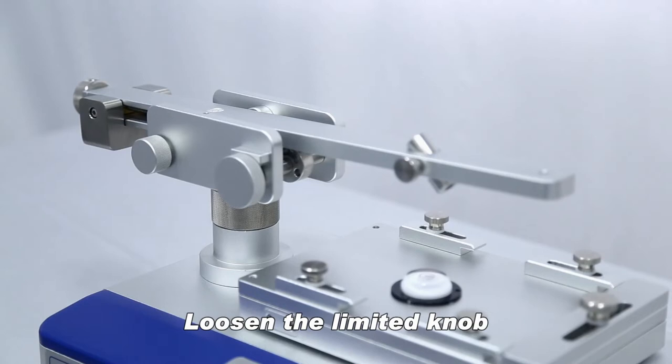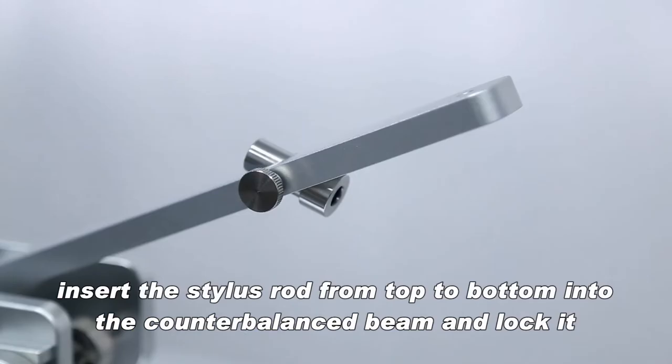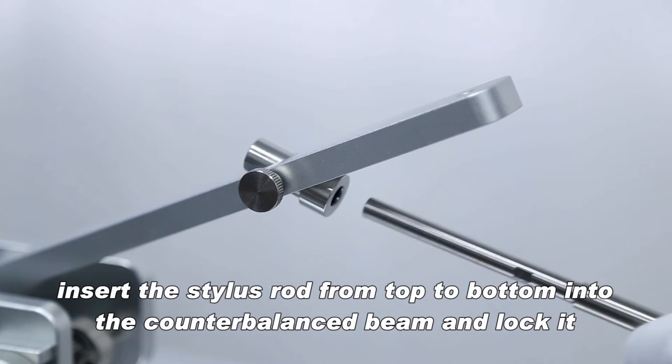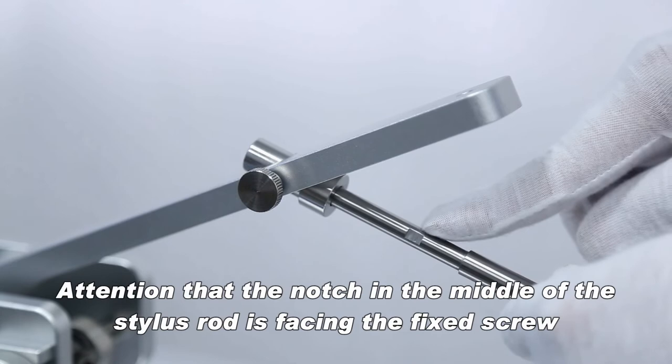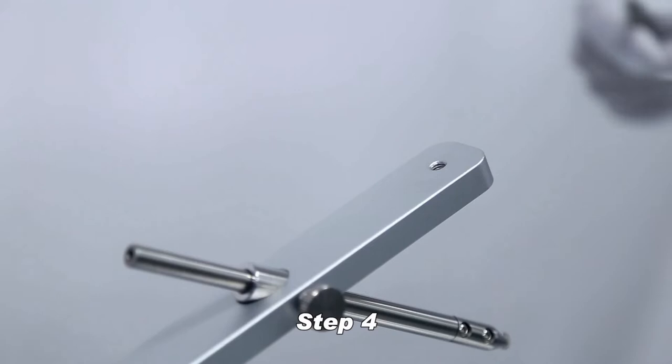Loosen the limited knob. Lift up the counterbalance beam and lock it. Insert the stylus rod from top to bottom into the counterbalanced beam and lock it. Attention that the notch in the middle of the stylus rod is facing the fixed screw. Install the weight holder and the gasket.